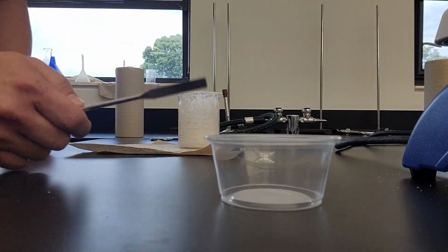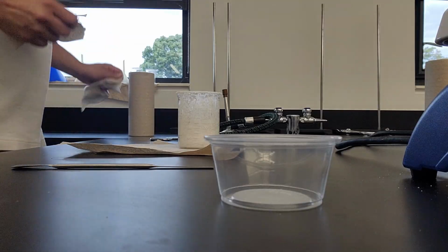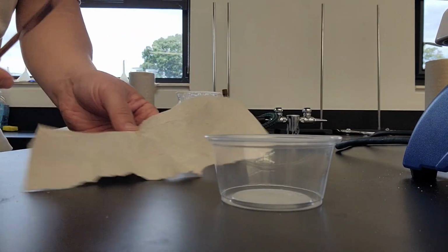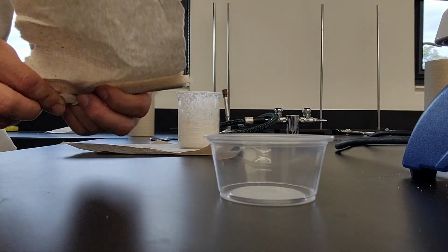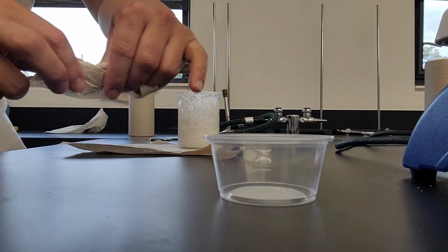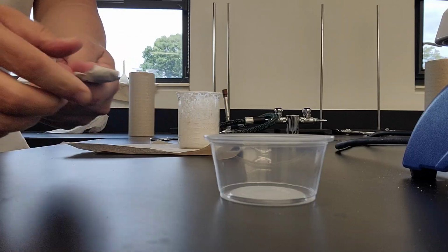I have a spatula. And since I want as much of it making contact with the glass, I'm just gonna kind of roll a piece of paper towel around it. If I had a rubber spatula, I would. I think I might, but let's see if this works.